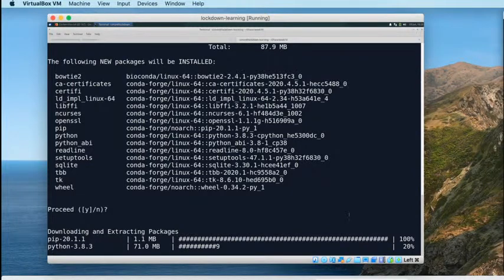The other thing that I want to do while we're doing software installation is, in this environment, install FastQC and MultiQC, because we should never embark on any bioinformatics process with sequencing data without first doing some QC. So we need to continue to reinforce the lessons that we've learned before, and we should be installing and running quality control at the same time as doing any of these bioinformatics processes. So we shouldn't skip that just because we're trying to do something new today. Once Bowtie2 is installed, I'm also going to install those QC packages, so that we can have a look at the QC of this data as well.